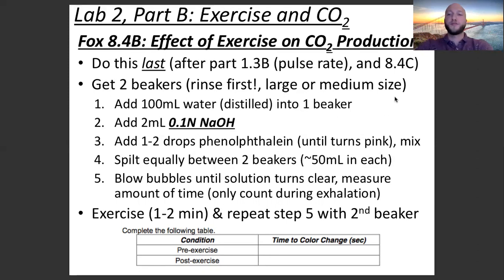We're then going to have some straws, and we're going to choose 1 student, and have that student breathe and exhale through the straw into the solution until that solution turns clear.